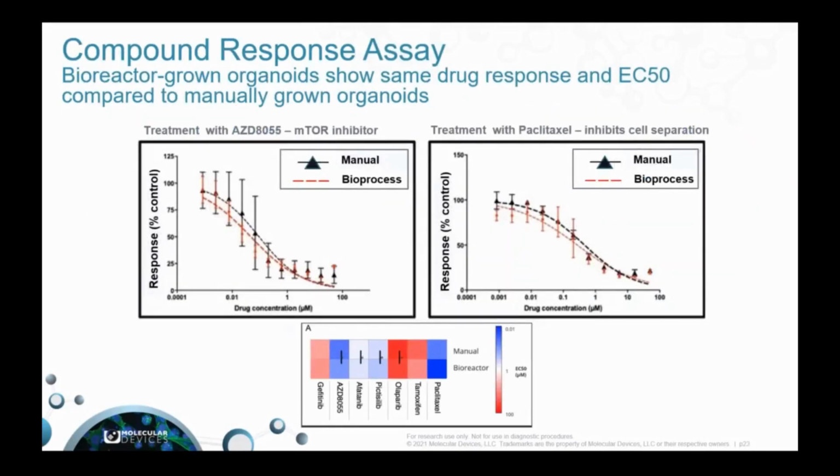For the last analysis, we did a dose response study. We carried out an 11-point compound titration, and these were performed in quadruplicates. So organoids were incubated with various compounds for 5 days, and this was followed by an endpoint CellTiter-Glo cell viability assay.